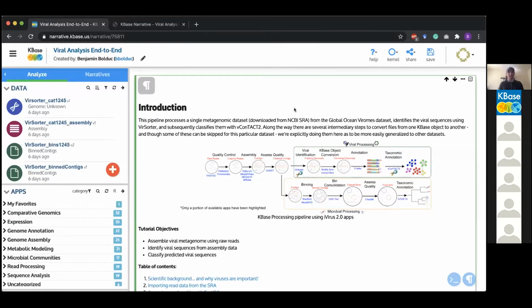Okay, so thank you to KBase for allowing me this opportunity. I'm super excited to be doing this. I've always been watching Ben and his colleagues at KBase do these webinars, and so it's been really exciting to finally get to lead one of these. If you're new here, welcome. Some of you, this might be your first KBase webinar, so welcome. For those of you who are tuning in for the 11th, 12th time, whatever it might be, thank you for coming to the best one, where we'll be talking about viral tools that are now available in KBase.